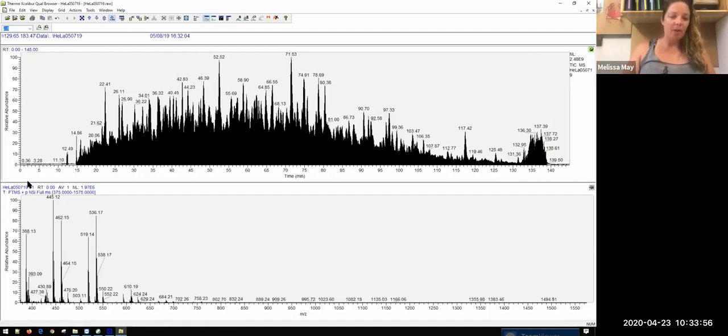What we have on the bottom gives you information about what's happening at any given time. So right here, you can see this is our runtime at 0. This is typically what our chromatogram looks like when we're just running acetonitrile. So this is the acetonitrile signal.